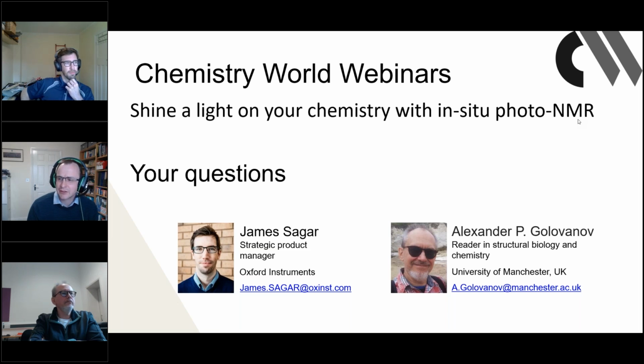Perfect. And you mentioned obviously need transparent caps for the NMR, which are not necessarily standard. So again, these are not commercially available. We tried a lot of makeshift caps of different construction. Again, hopefully this will be described in the paper that is about to be, I hope, sooner or later, published. But any cap that you can kind of create in your lab that is transparent enough would do.